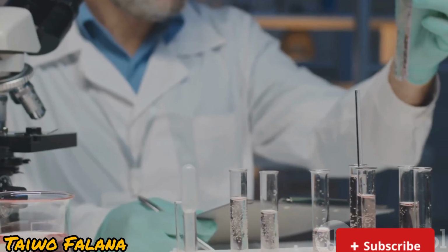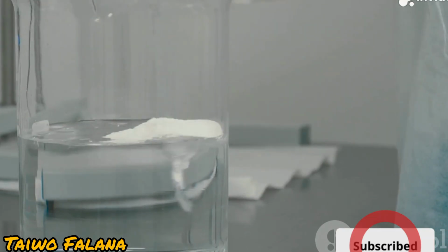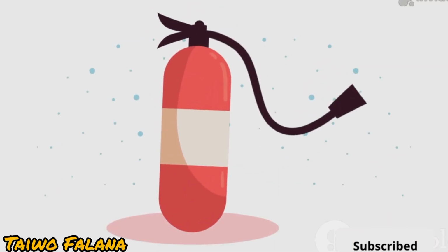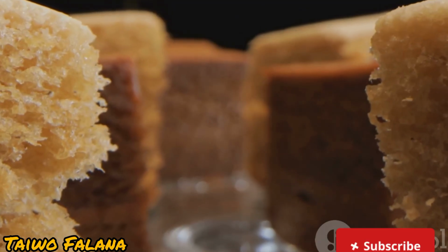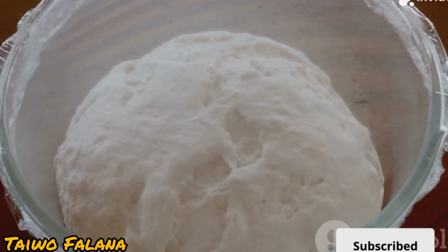To test if you've actually made CO₂, pass it through calcium hydroxide solution or lime water. If it turns cloudy with a white precipitate, you've nailed it. CO₂ isn't just lab trivia, it's used in fire extinguishers, soda drinks, and even baking. That crackly texture in cakes or mandazi, that's CO₂ from baking powder, making your dough rise.